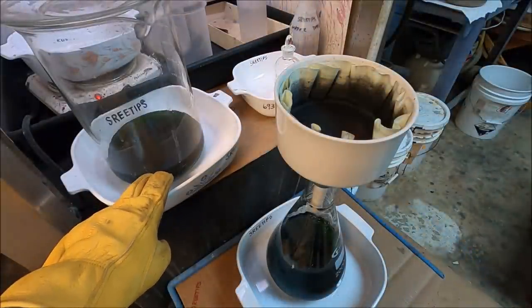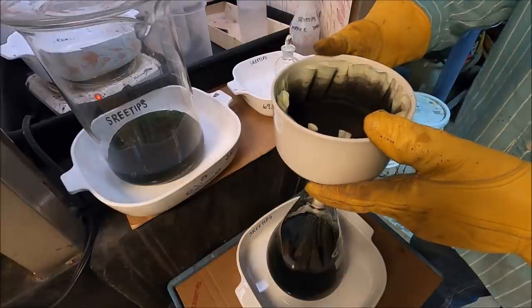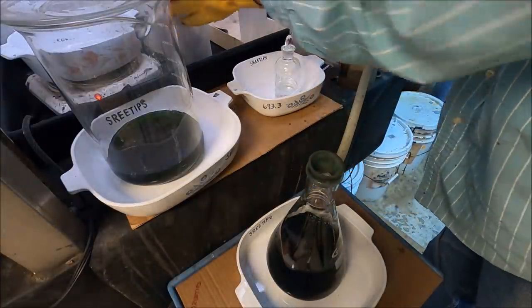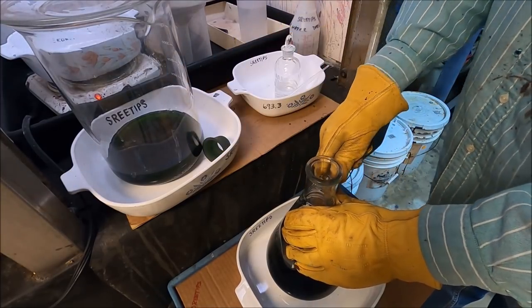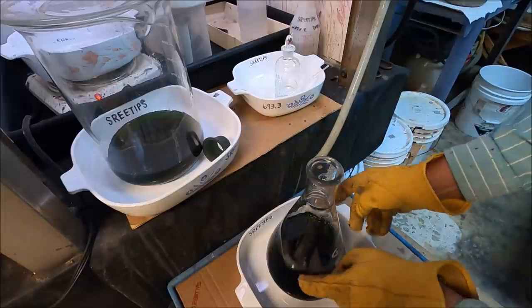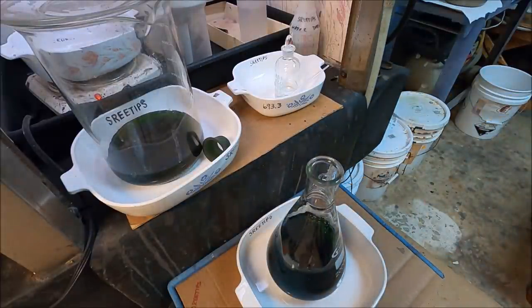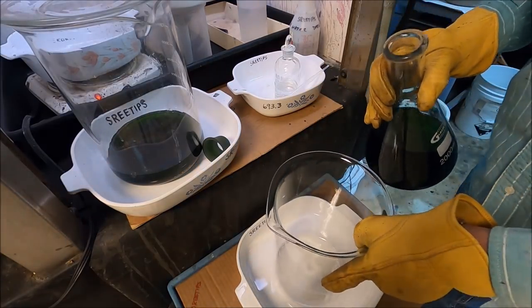Our solution's cooled off a little bit now. What I'm going to do is take the solution out of this flask, and we're going to transfer it to a beaker here so I can make some room in the flask. I've got a 4-liter beaker here, and we're going to put the solution in here.